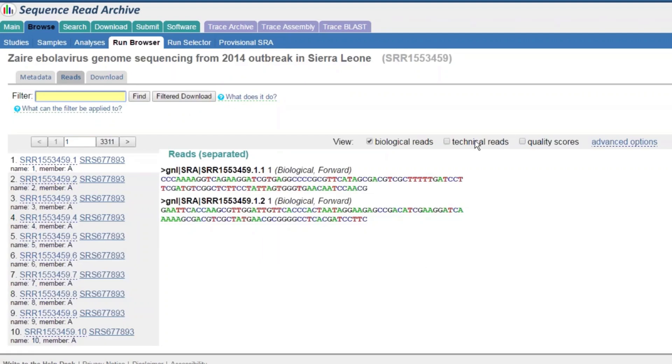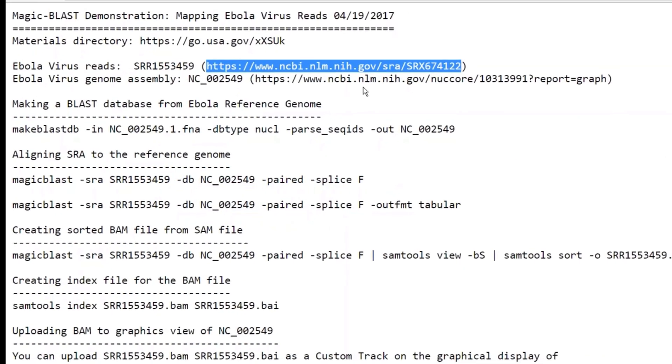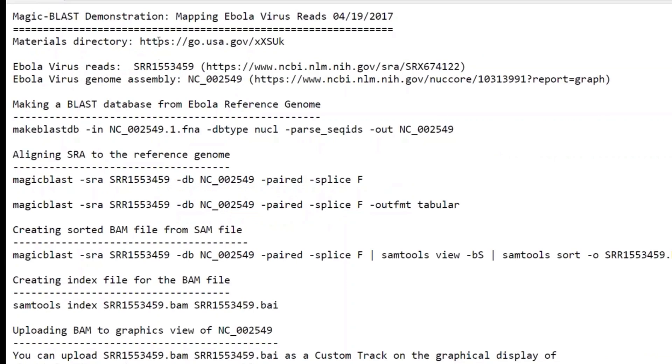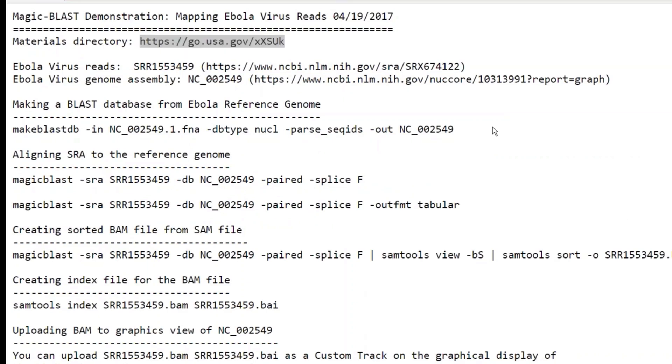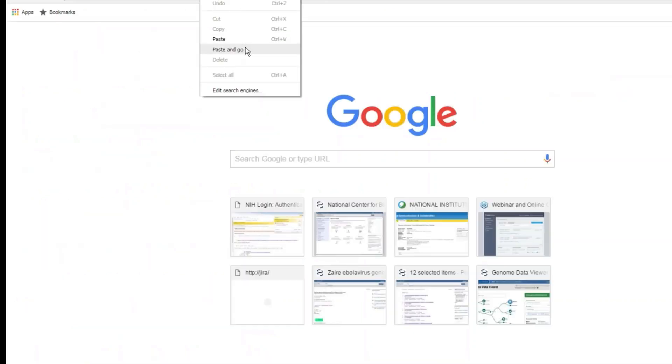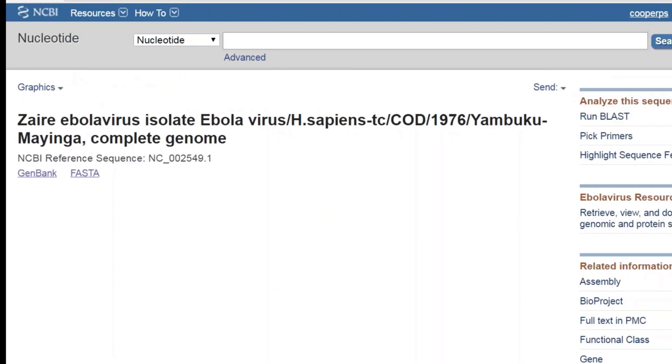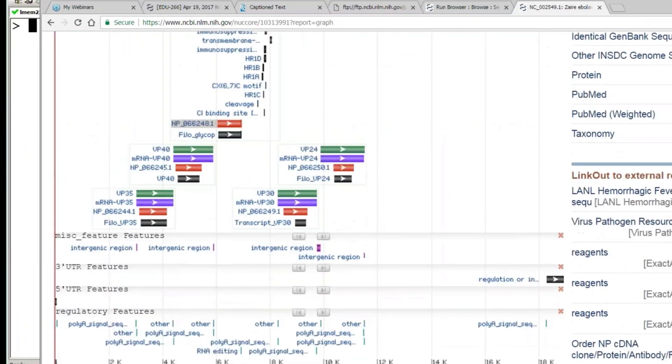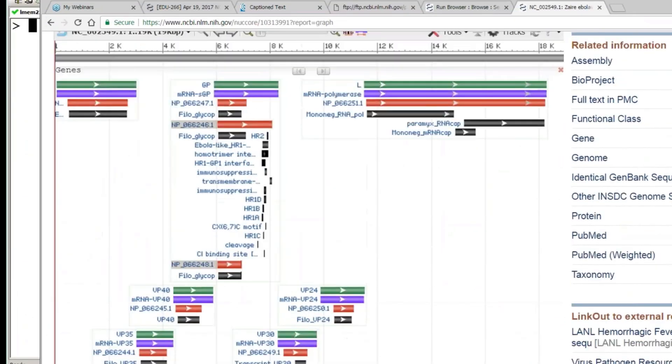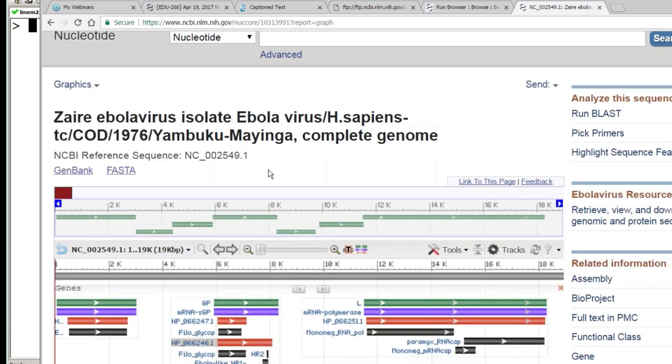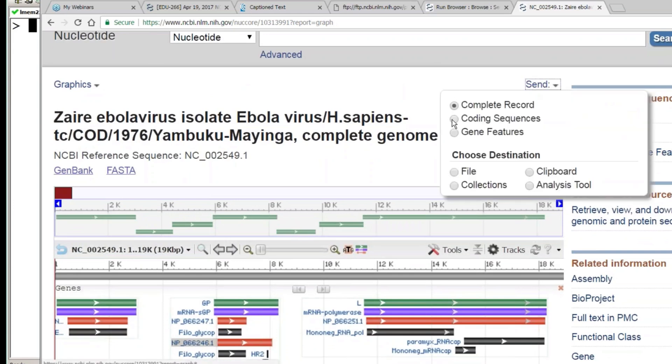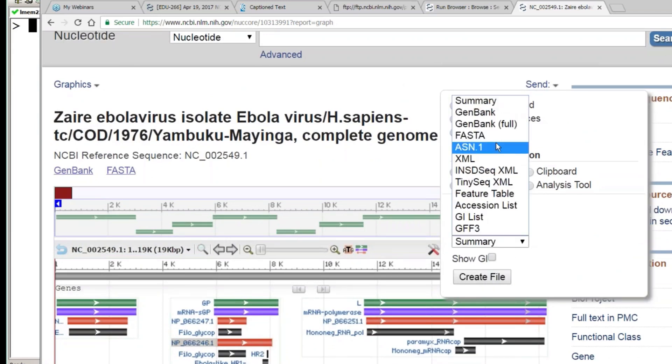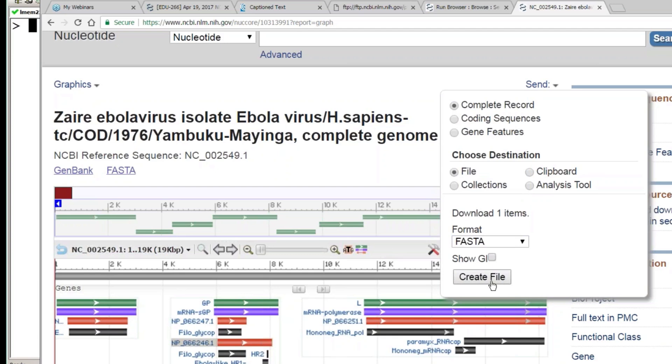The thing that I want to align this to is the Ebola virus genome. By the way, this particular file that I'm showing you right now is on the FTP site in the directory for this webinar. The other thing I want to just get up for everybody right now is the graphical view of the reference genome. We're going to come back to that in a little while and upload our alignments. This is the reference genome of the Ebola virus. We're going to add a track to this in just a few minutes. One of the first things I could do from here is I could easily download this. I could send it to a file in FASTA format. I've already done that, so I won't bore you with that download.